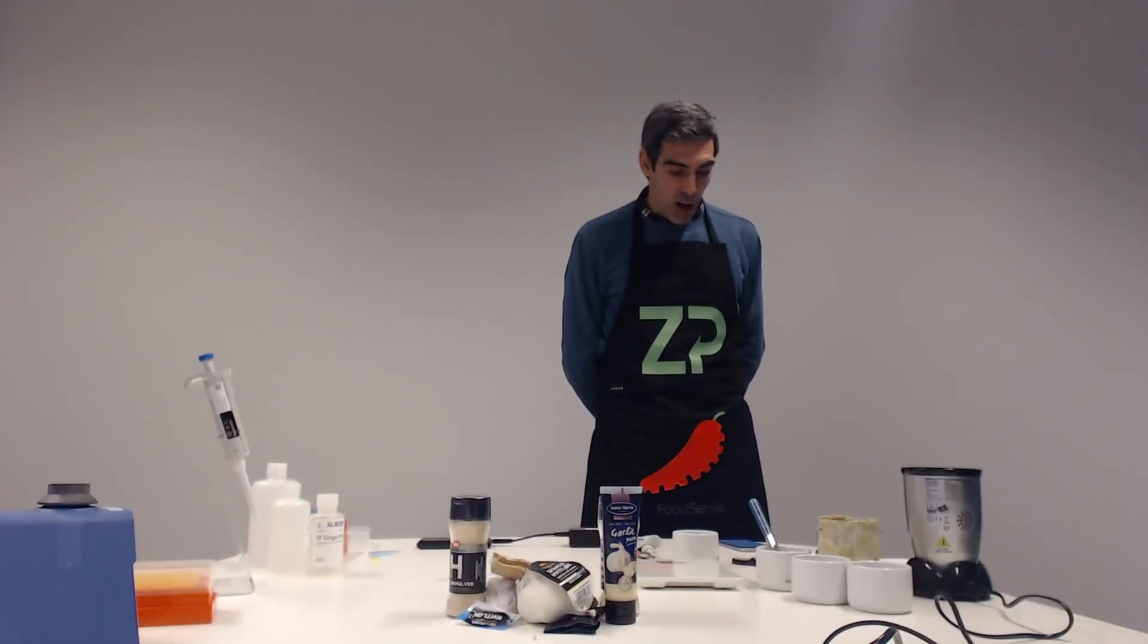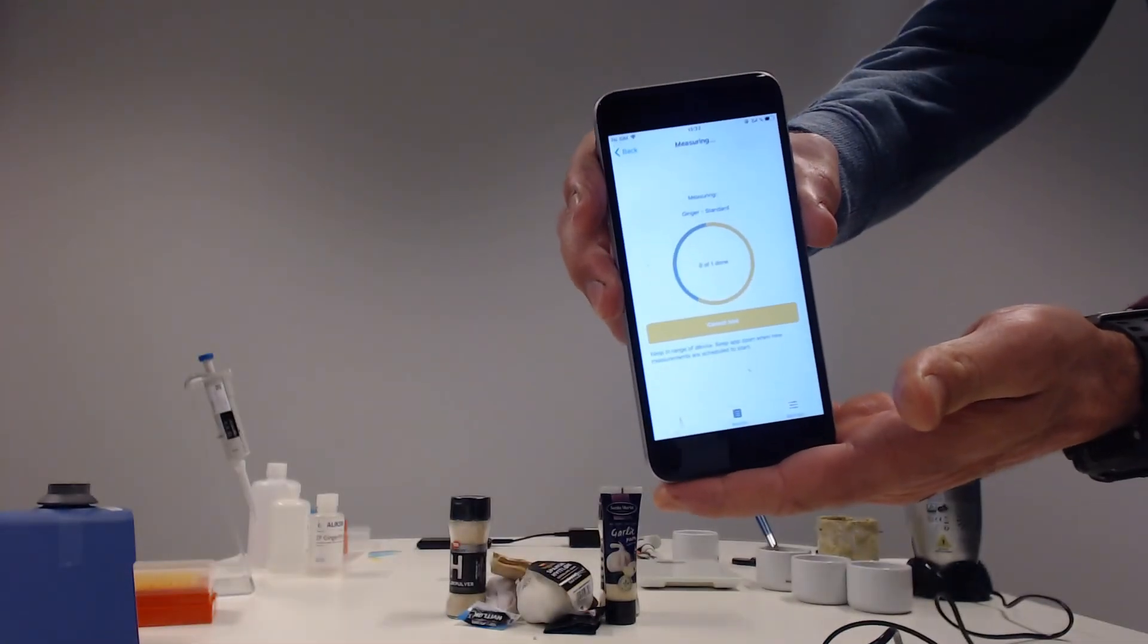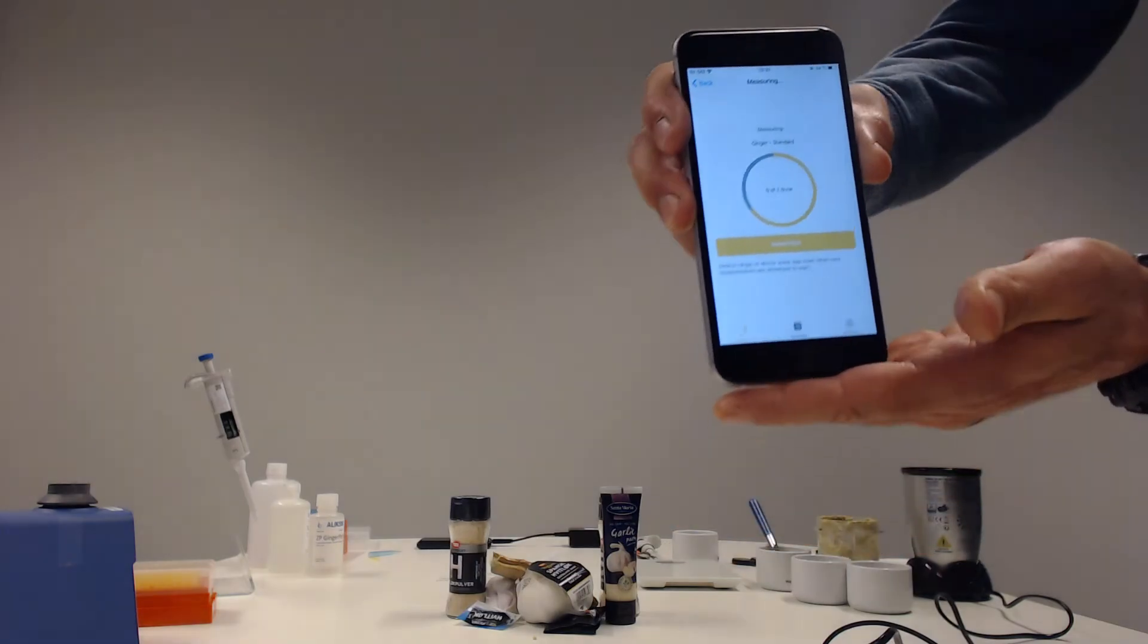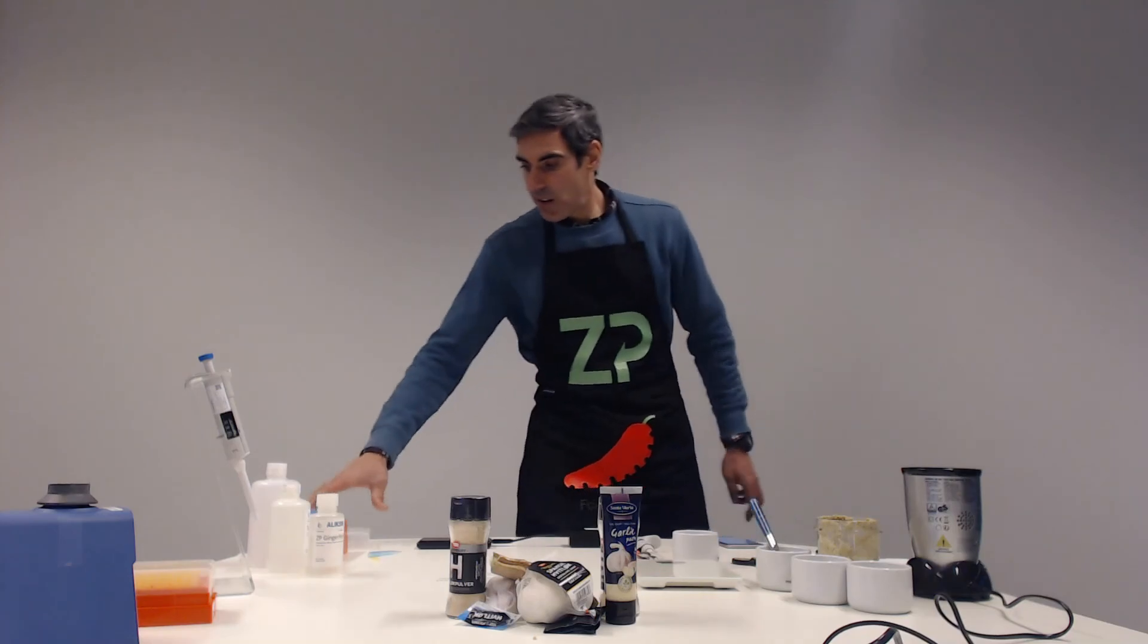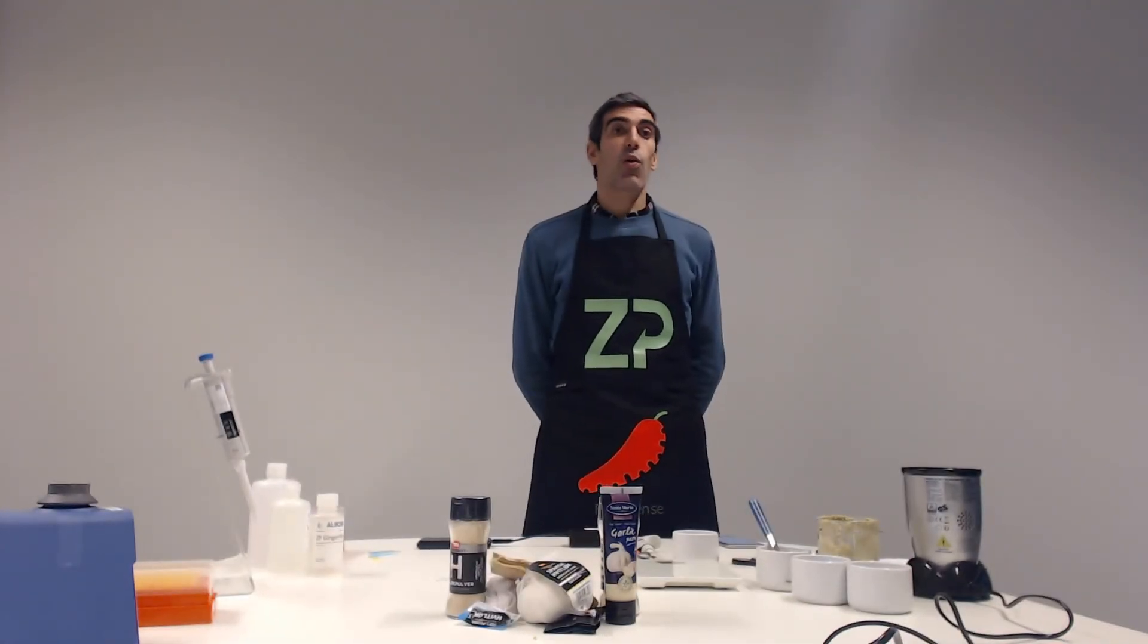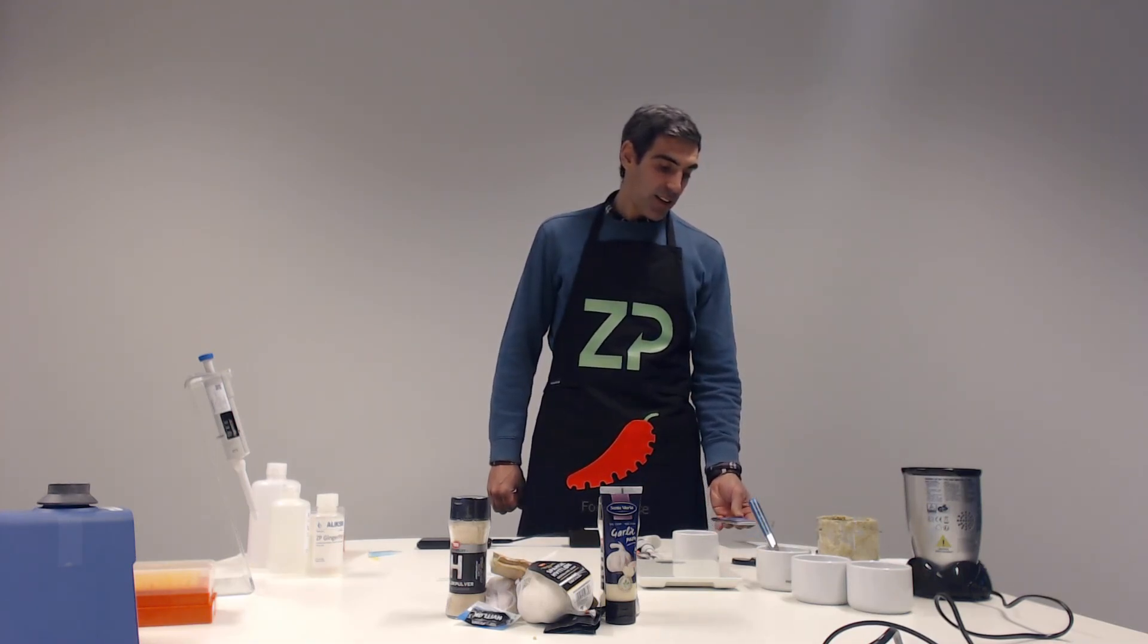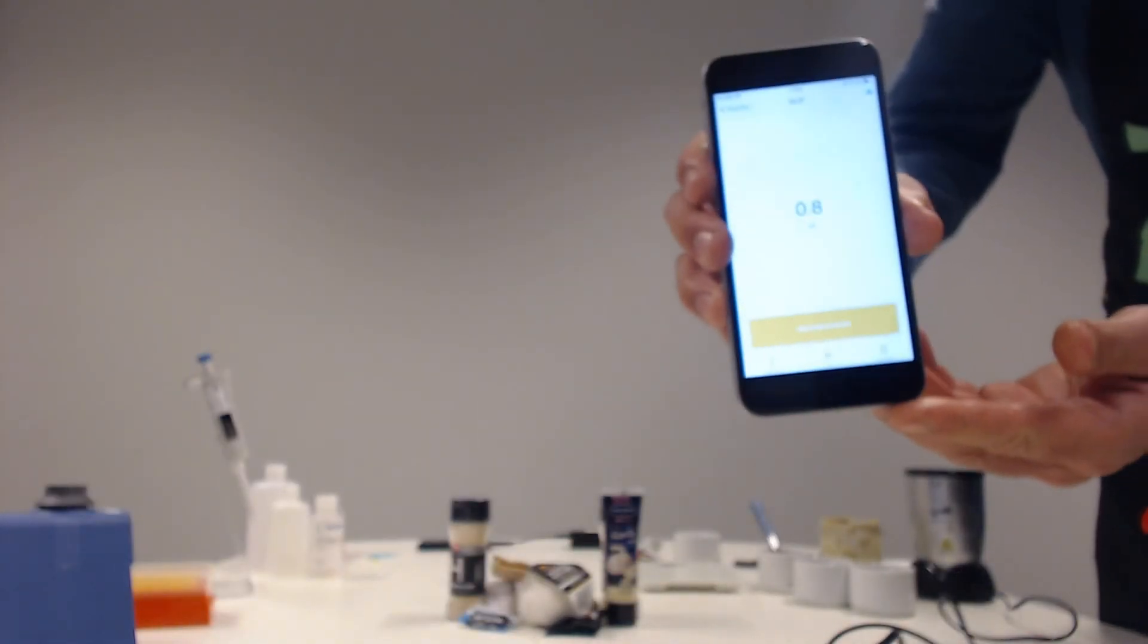So the measurement is now halfway completed. I can show to the audience how it looks. As you can see, it's running the assay and soon will give us a value. Any questions about this video, please do not hesitate to contact our team. We'll be happy to help you. And the value here is 0.8 millimolar of gingerol.